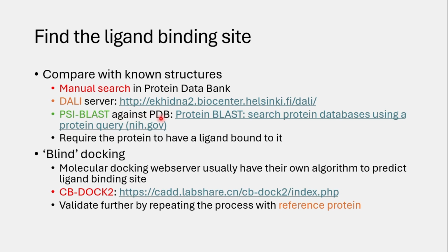Alternatively, you can submit your sequence, not the 3D structure, of the PYL10, and we perform PSI-BLAST against the protein data bank. PSI-BLAST is a bit different from the normal BLAST-P because PSI-BLAST is more towards finding structural similarity. This is a very surface explanation about what it is. The truth is much more complex, but I'm not going to delve into it in this tutorial. It's more of a how to use it rather than explaining what it does.